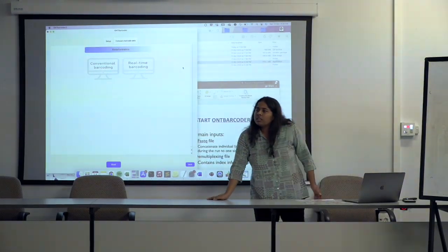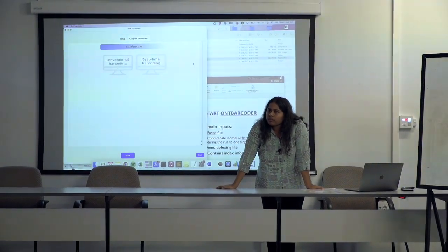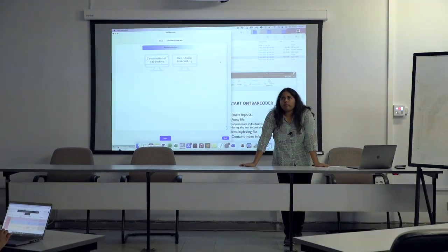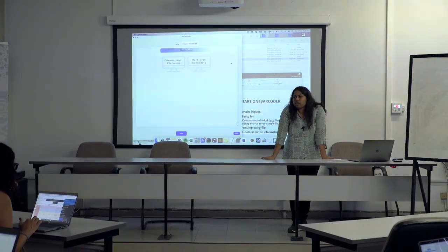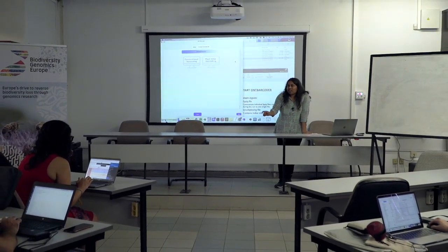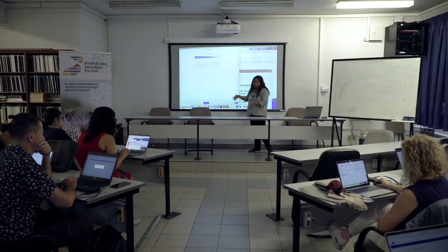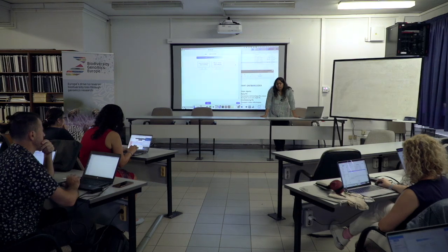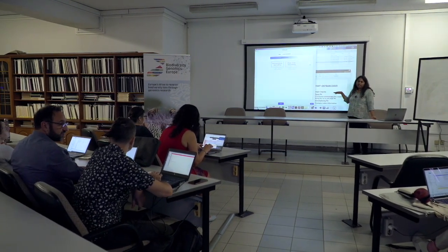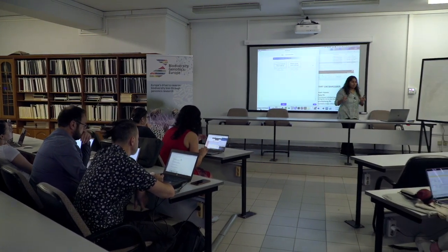Yeah, of course. So we have always wondered why the demultiplexing is only around 50%. Could you explain a little bit more about that? Yes, of course. Part of the reason is, of course, the errors. For us, we want to get as much accurate data into the bins as possible rather than getting more. You can, of course, maximize demultiplexing rates by including more errors. We always demultiplex both pass and fail, so it's not a QC controlled file here. You can probably get more if you did quality filtering in your data set.